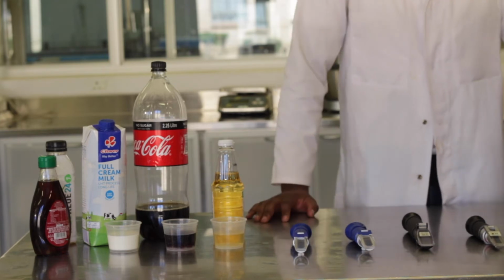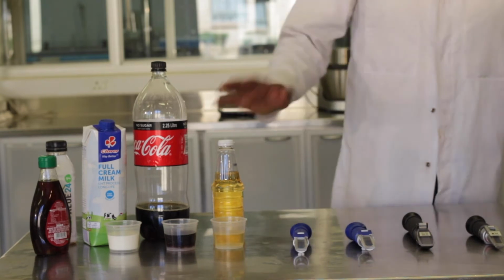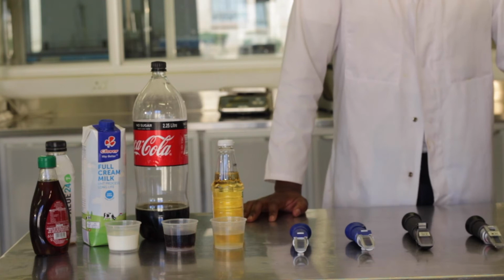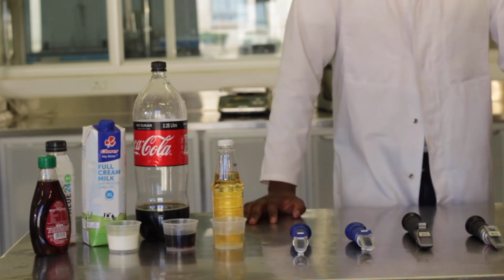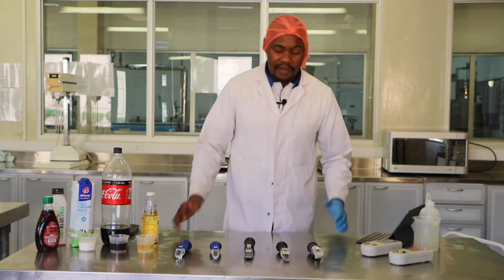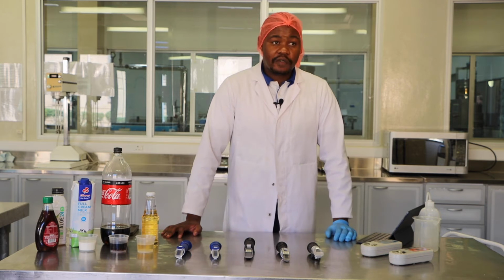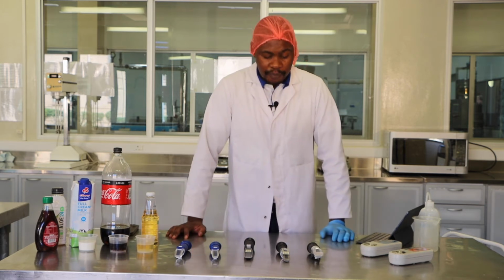So they have replaced the sugar, sucrose, with something else. We're going to establish whether it is really true that Coca-Cola does not have sugar in the sense of sucrose. We can also establish the sugar concentrations of other beverages such as milk, fruit juices, and some of the beverages that are juices in nature.